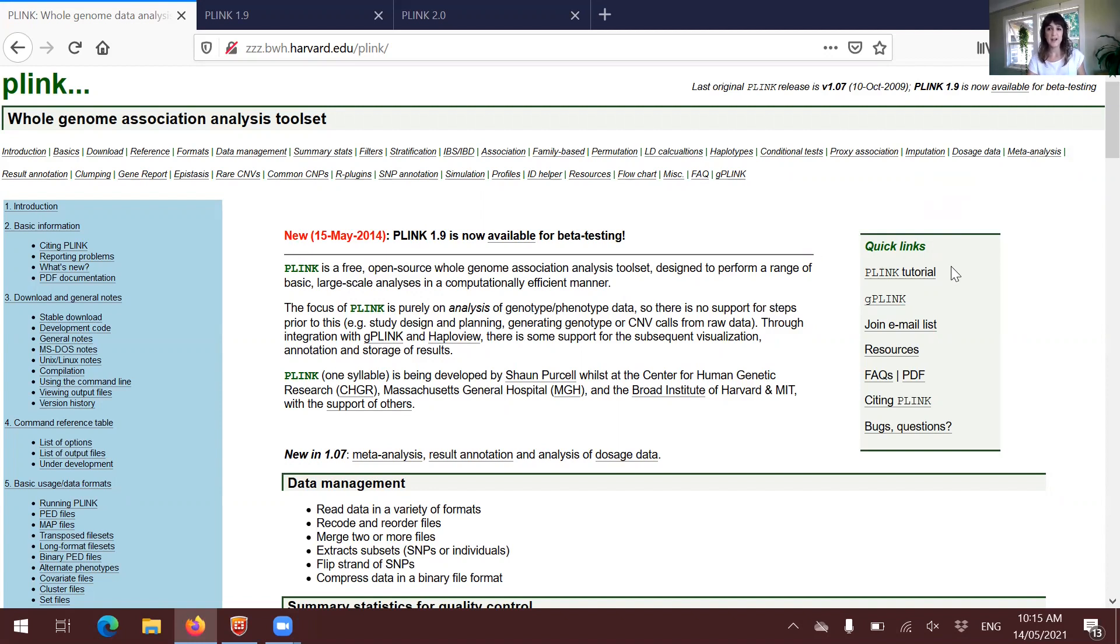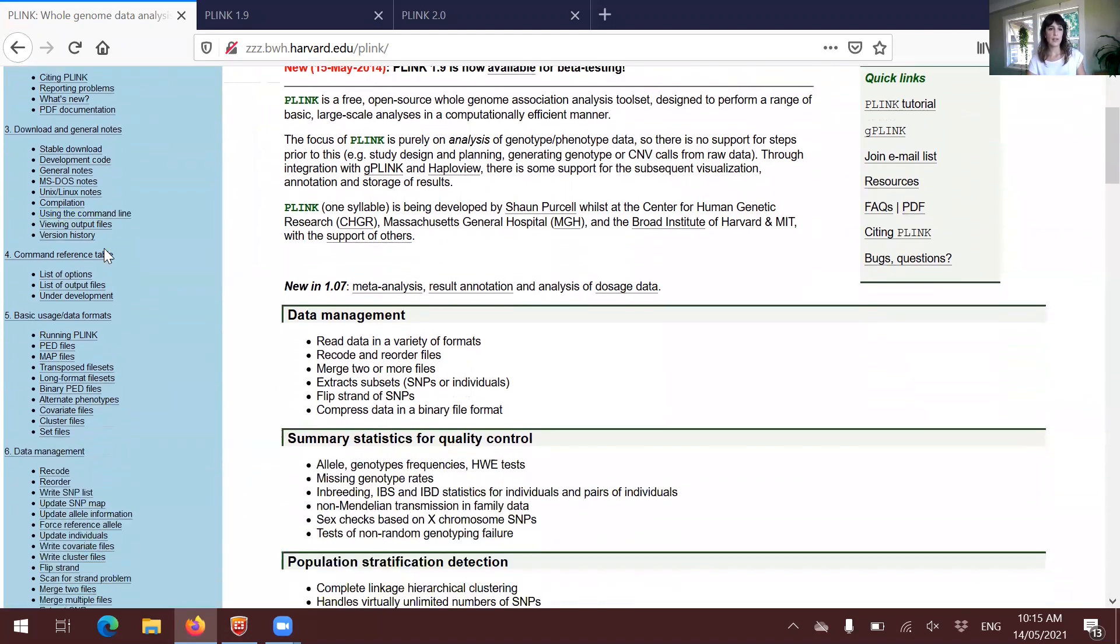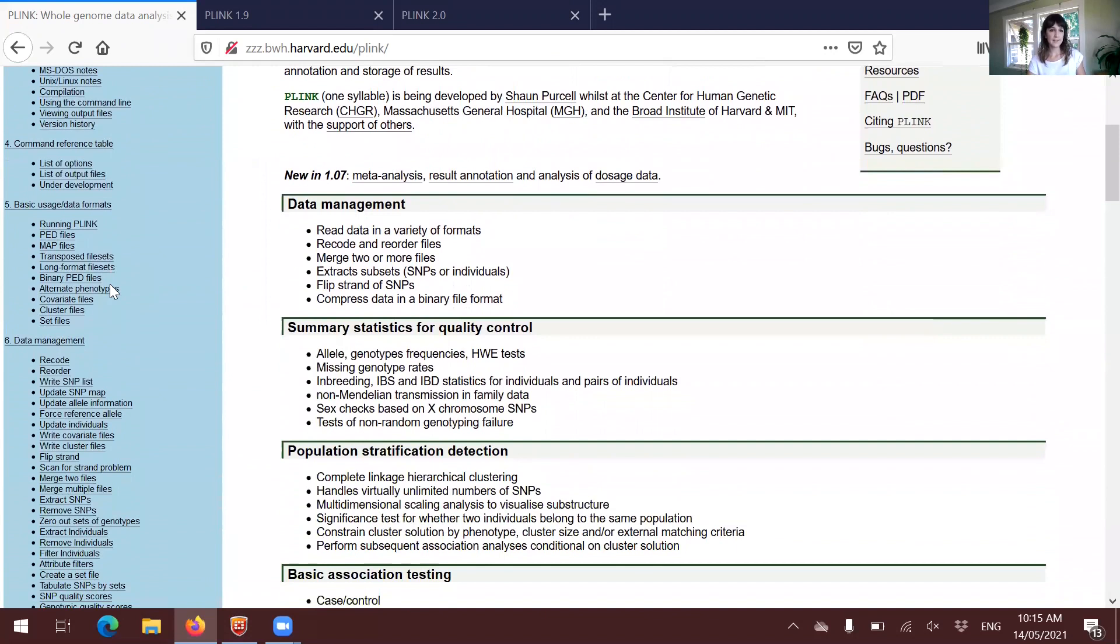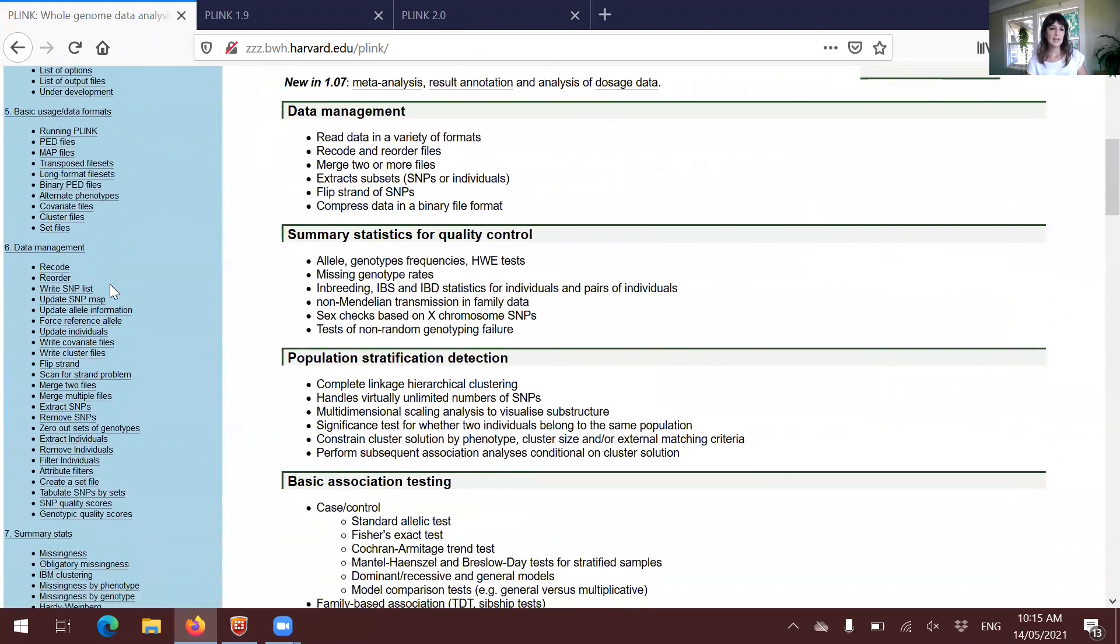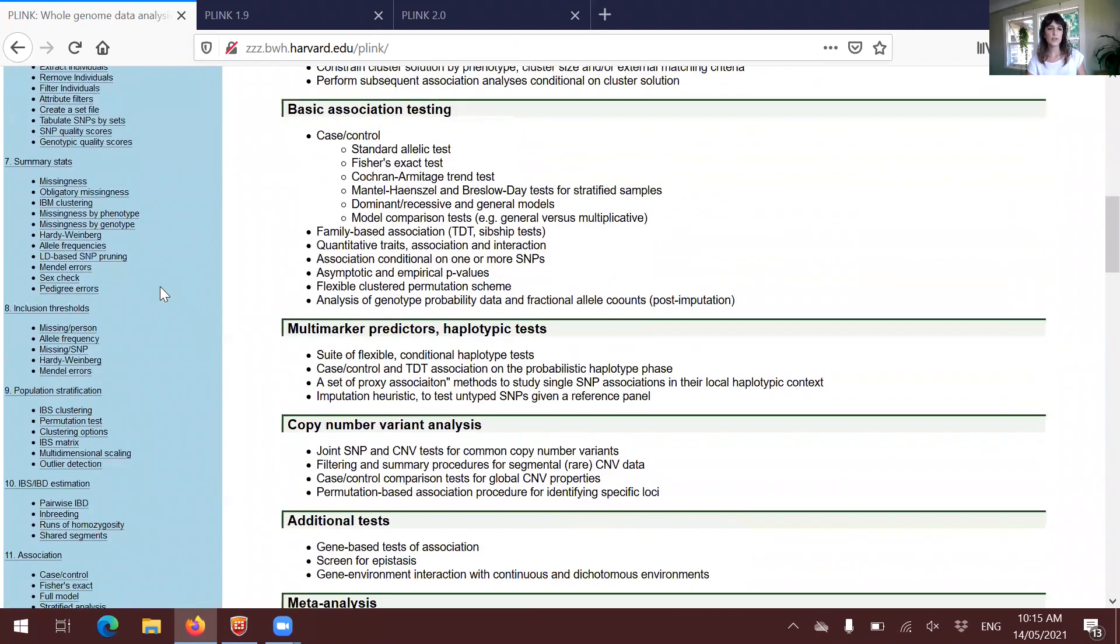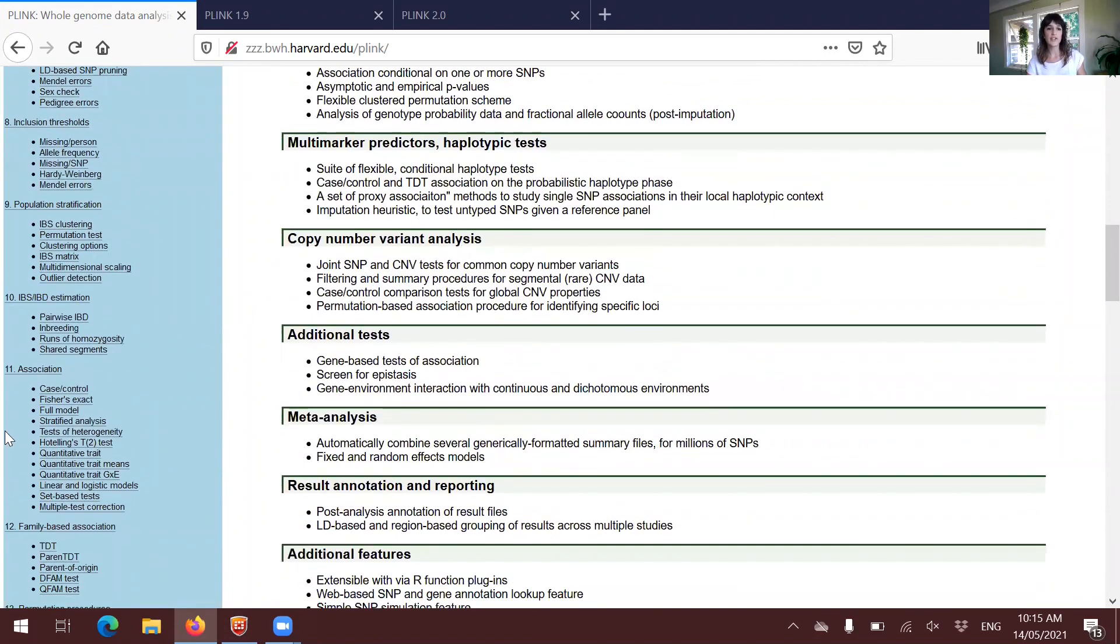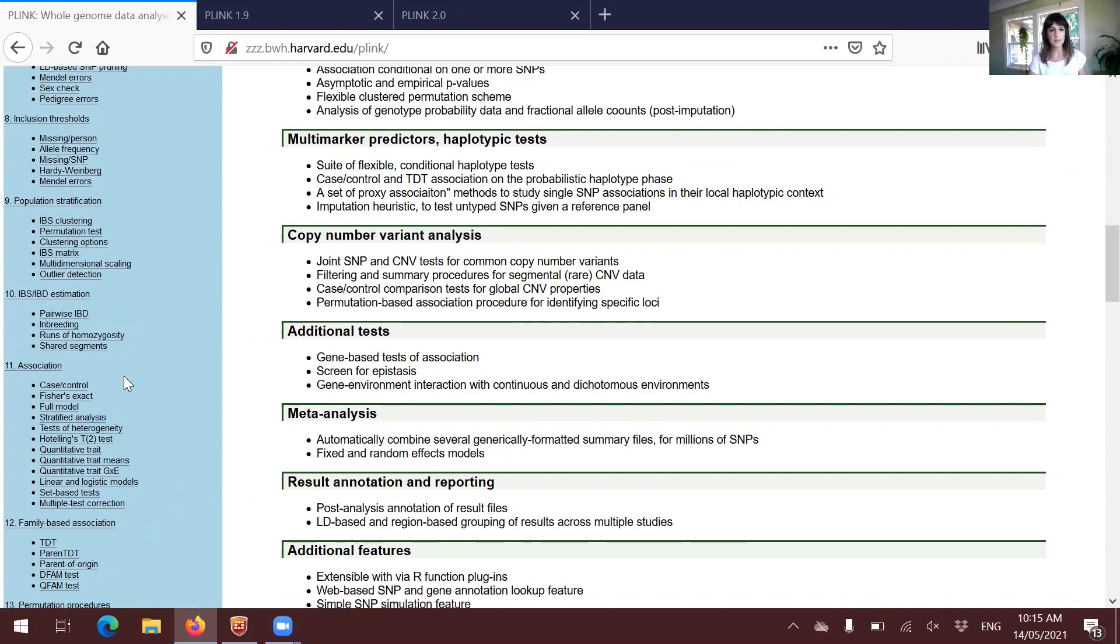It also includes a tutorial, frequently asked questions that are very good. And anyway, you will be usually navigating the menus at the top or here on the left-hand side. Very important, at least for the practical today, we will be checking the data management section and also the association section because that's the main menu for the GWAS.